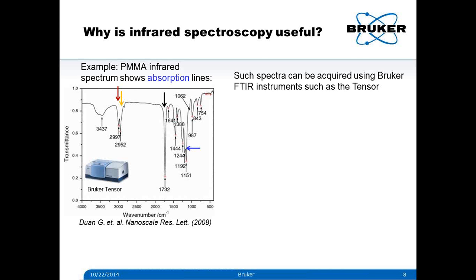For example, you can identify which system it is, or you can see what external stress or doping changes in these resonances. What we do here on the left side is measure a PMMA infrared spectrum with far field. So you see the transmission versus wave number. 1000 wave numbers corresponds to 10 micron, which is roughly 110 milli-electron volts, just to give you an idea of the scale.